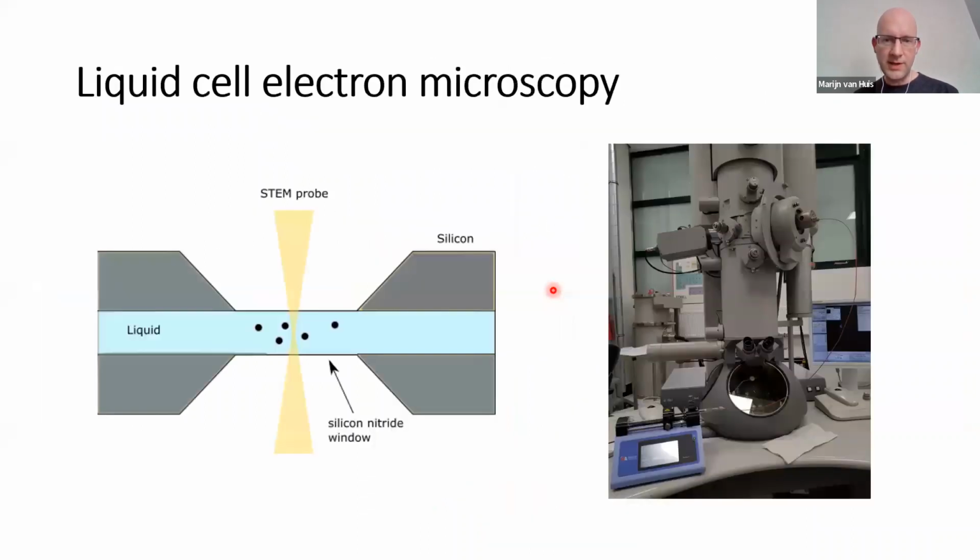Now, that brings me to the real talk. So what we did with liquid cells lately. This is the system that you have to insert into the electron microscope. There are tubes connecting, liquids going in, at least one liquid going out. There are options also for heating, and there are options for biasing, so to have electrodes inside the liquid.